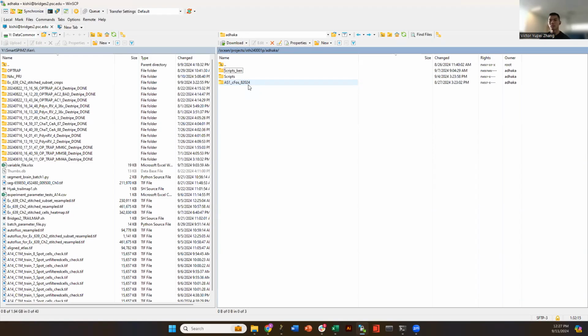So another thing you want to do is make sure, maybe post hoc, that the two classifiers are performing at the same rate. And that can be quantified using the F1 score. Ultimately, I don't think there's a correct way to do it, but at least having some value that can prove that the classification is not too different between the two batches is important to assure that you're doing something correctly.